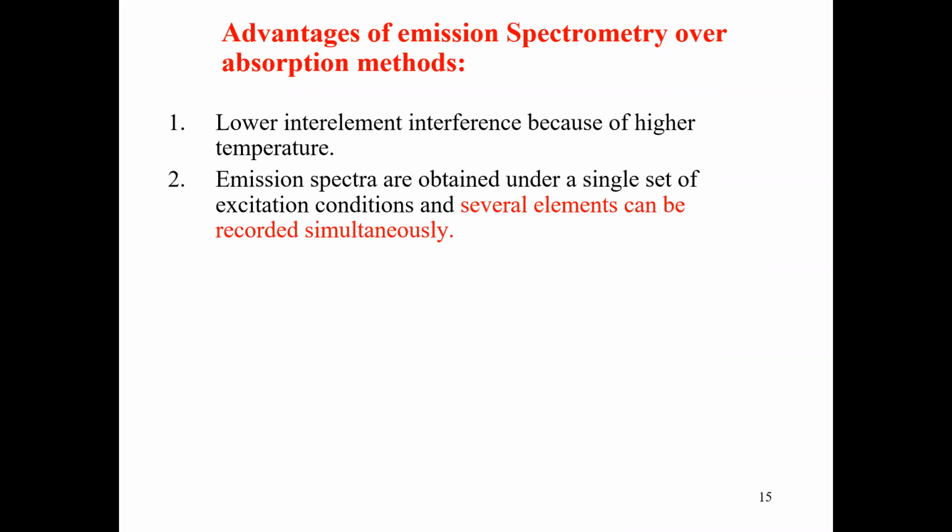That is short enough. So emission spectra are obtained under a single set of excitation conditions, and the advantage here is several elements can be recorded simultaneously.